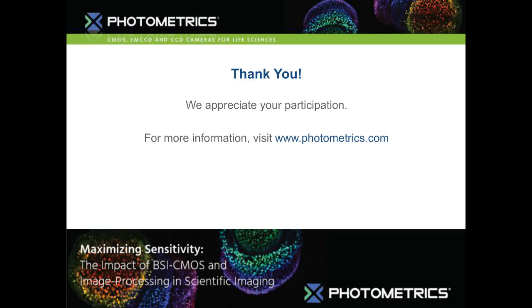The EMCCD will also have the advantage because the minimum noise level tends to be less than 1 electron. So you would be able to detect dimmer signals with higher image quality, but anything more than about 10 photons or so, you would get a better result with a binned 2x2 pixel from the backside illuminated Prime BSI.